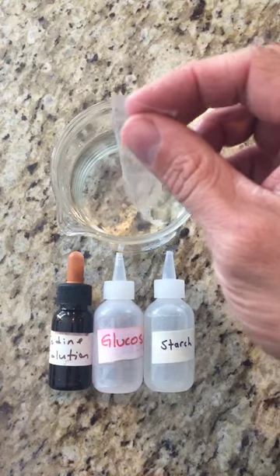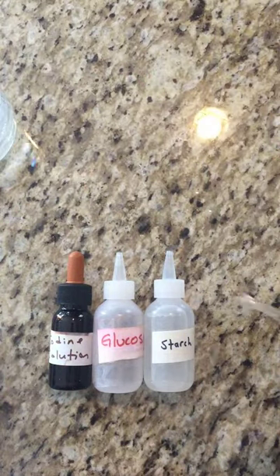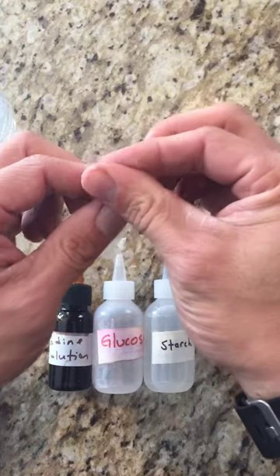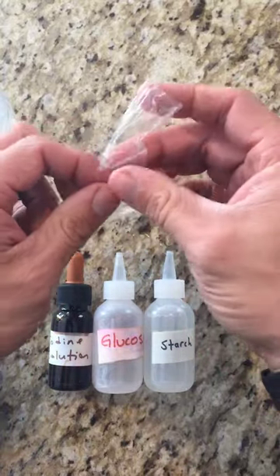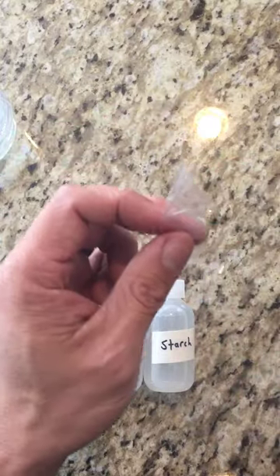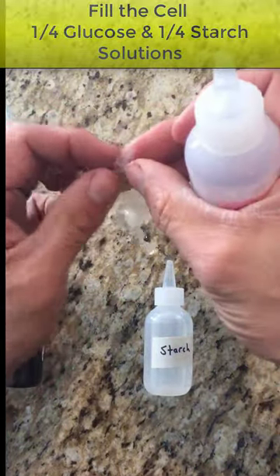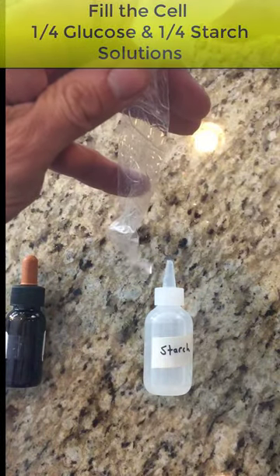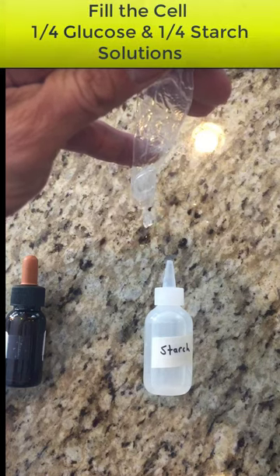Once you have one end tied up, you have to start adding your solution. Don't do it over the beaker because you don't want any solutions getting in. Take the other end of the dialysis tubing and rub the ends together — since it's wet, they should peel apart easily. Then pour your glucose solution into the tube, filling it about a quarter of the way up. You don't want to fill it all the way.